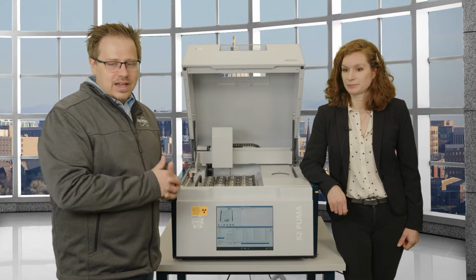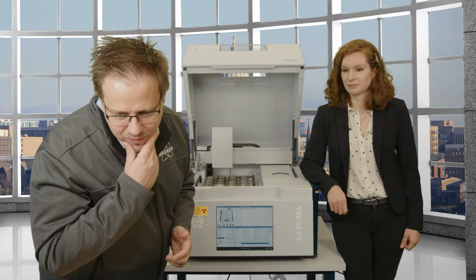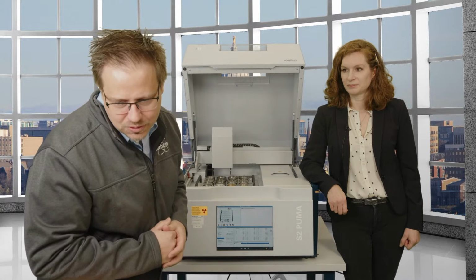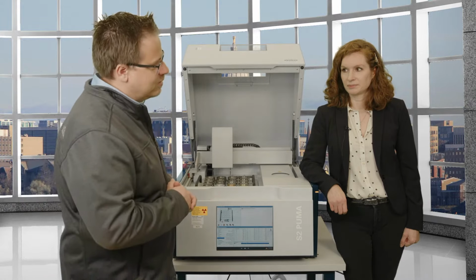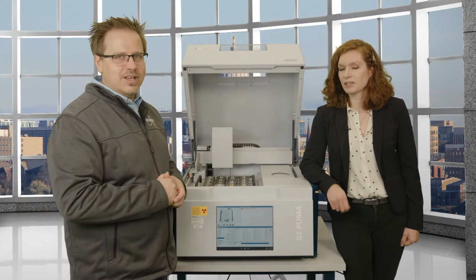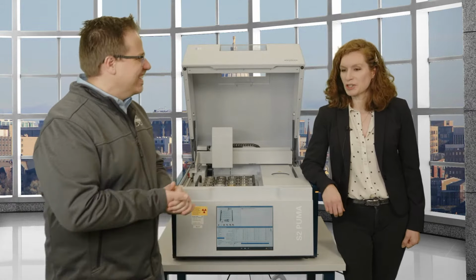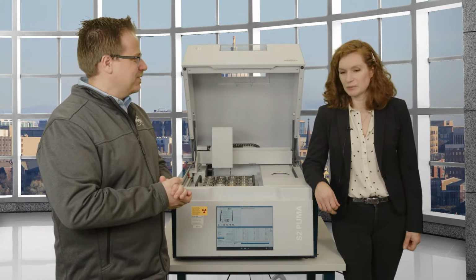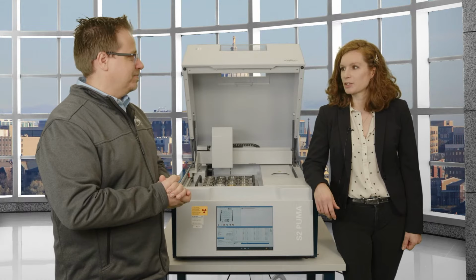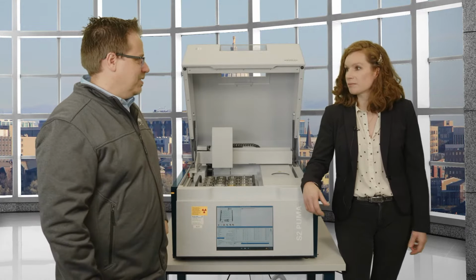So with that, we're going to sneak in this one from Tahir. Can we analyze industrial waste materials like sludge or catalyst contaminated soil? Yes. But it depends on what you want to measure, right? What are the levels? But in general, yes. Just tell me a little bit more about what exactly it is. If you want to measure soil and see if there's, I don't know, cadmium in it, yes, you can measure that.